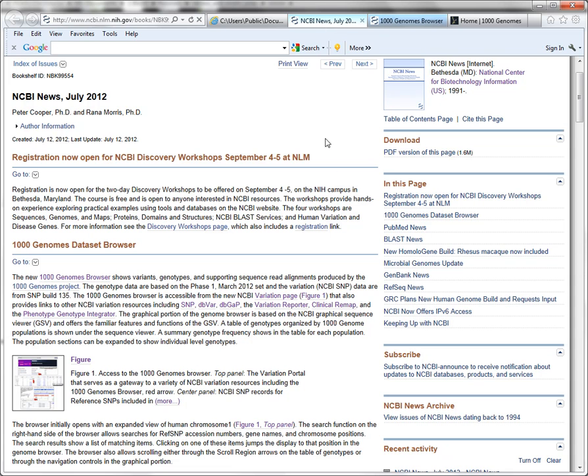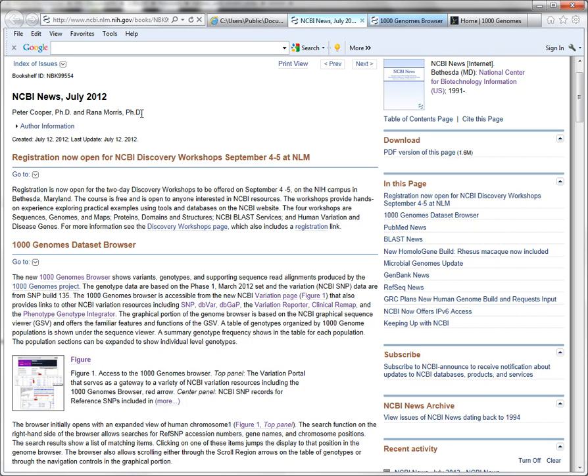I would like to demonstrate a new resource from NCBI. The resource was announced in a recent NCBI newsletter, and the name of it is the Thousand Genomes Dataset Browser.